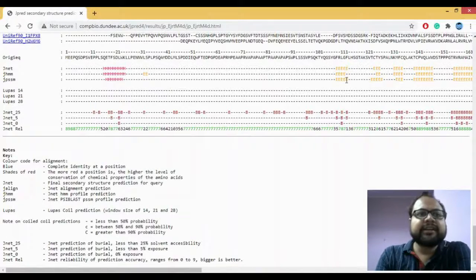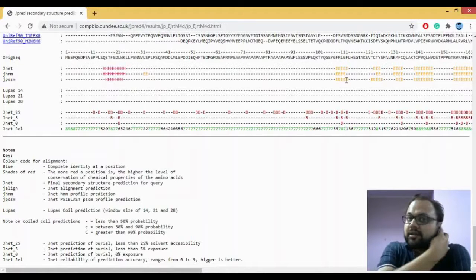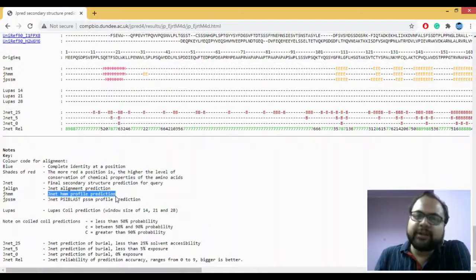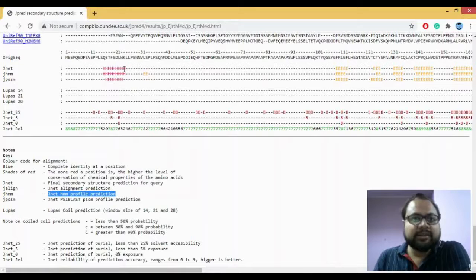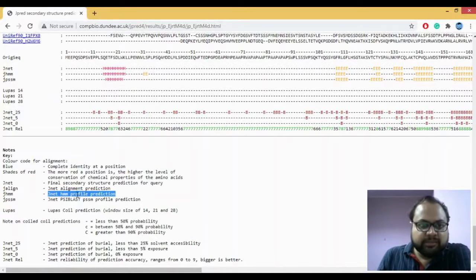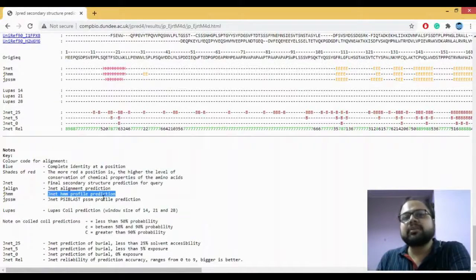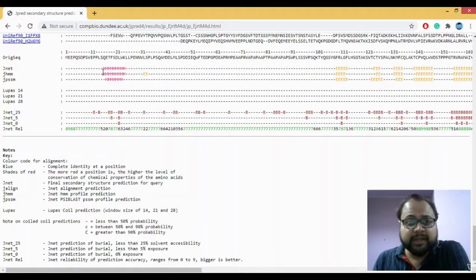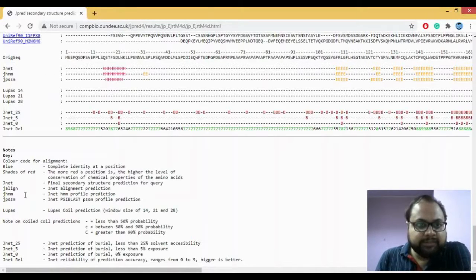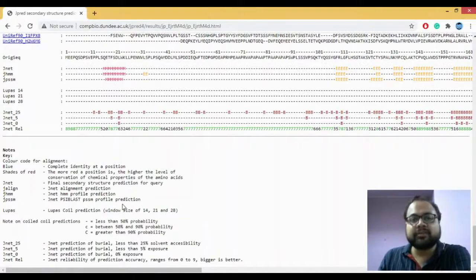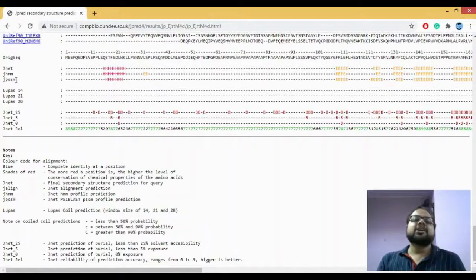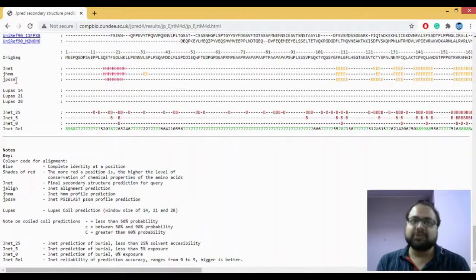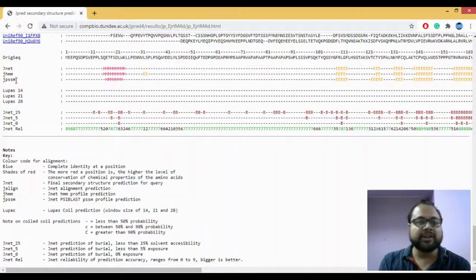JNet gives the final secondary structure prediction. JHMM uses the HMM (Hidden Markov Model) method to predict secondary structures. JPSF uses PSI-BLAST and a Position Specific Scoring Matrix (PSSM) to make predictions. So JPred gives you the secondary structure prediction using all possible methods: multiple sequence alignment (JNet), HMM (JHMM), and PSSM (JPSF).